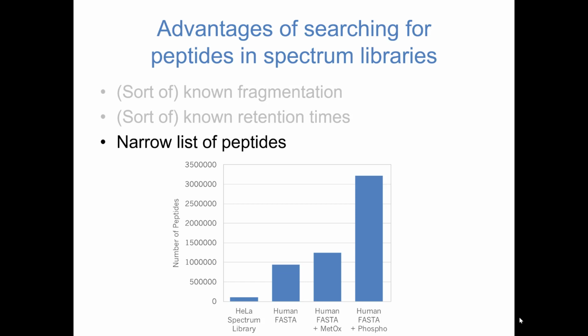If you want to use a different type of validation approach, like Percolator, for example, I think Mike might be a better guess, but I would say Percolator probably doesn't perform very well below 1,000 peptides, something like that. Yeah, I mean, you need to be able to train the support vector machine. There are ways in which you can resort to a fixed discriminant score, but currently that's not used. So you probably do need a minimum number of things to have.